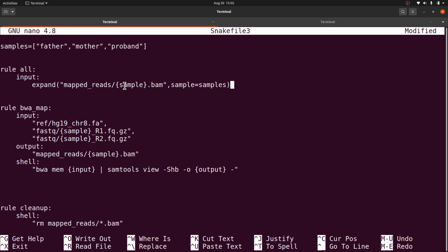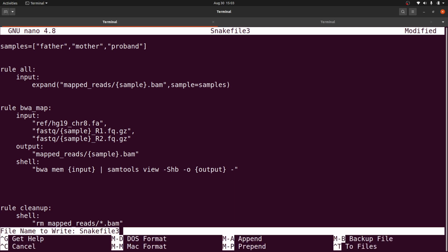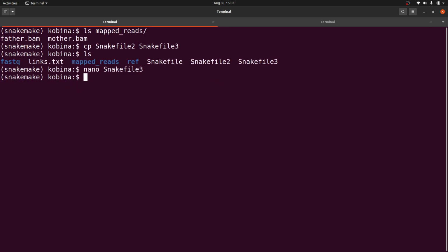All right. So we will run this. So this is the only thing we are changing. Compared to Snakefile 2 and Snakefile 3, this is the new addition. This and then this. All right. So let's edit and save changes. And then let's rerun Snakefile 3.